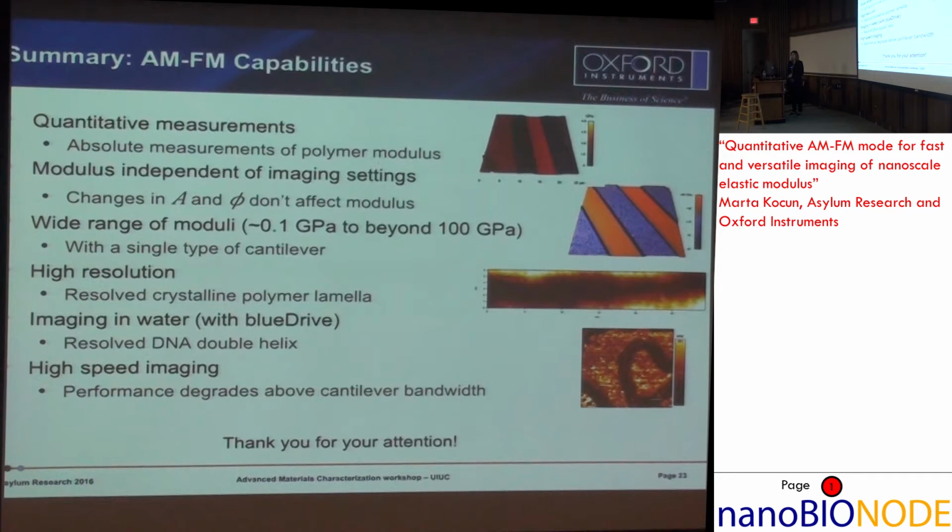So in theory, you should be able to resolve quite a bit. All these calculations are done based on frequency shifts, so in theory, you should be able to resolve a lot. Now in practice, what I was doing was looking for, let's say, half a gigapascal in terms of polymers. That's easy to see.